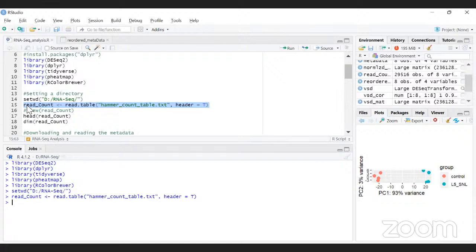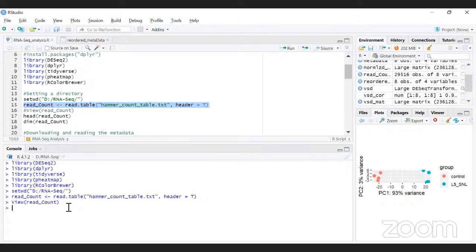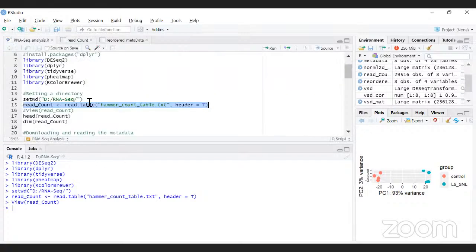Okay, so there are a bunch of breakdowns, and this is how the read count looks. Yeah, maybe you can give a quick recall for the missing part of the slides. Oh, sorry. Yeah, sure. So the idea is that I am actually using R right now, and I am using a bunch of libraries that enable me to do different stuff. For example, DESeq is a library that I spoke to you about earlier.